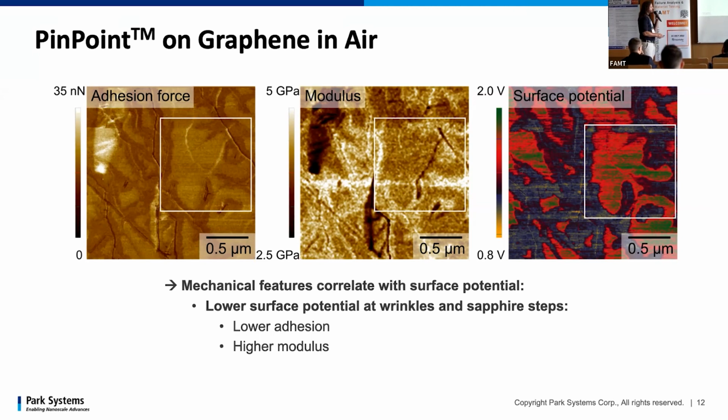Concerning the quality of these data, these measurements were done in different modes. KPFM is usually done in a so-called non-contact mode, where we don't touch the surface at all. We oscillate the cantilever, and we avoid mechanical interaction. For the mechanical data, however, we really slowly press down on the surface and map the cantilever deflection.